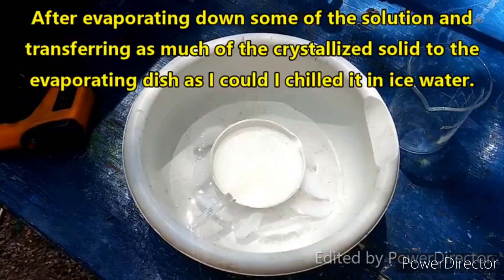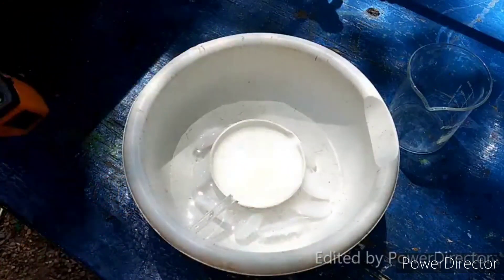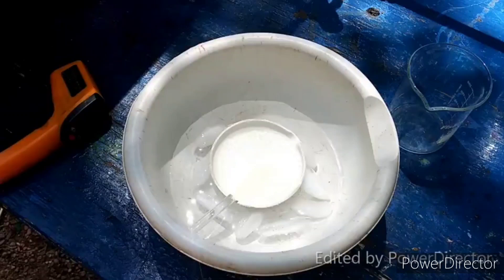I've got this where it's been chilling down in ice water for a little while. We've got some beautiful crystals here. The temperature of it is about 13°C — in reality, when I measured it after stirring it up, it's more like 11°C. Close enough. We're going to be content with that.